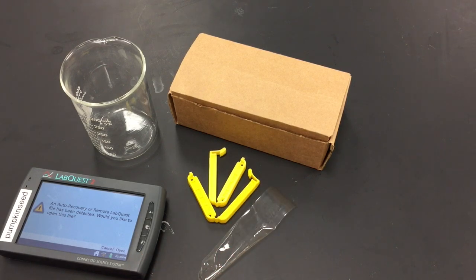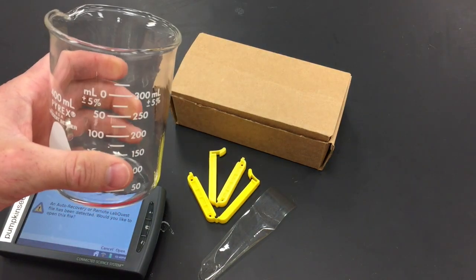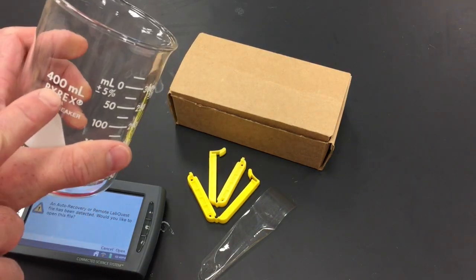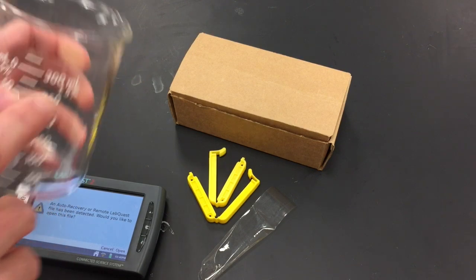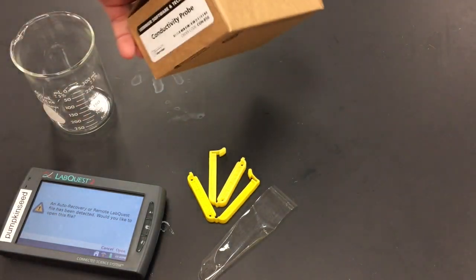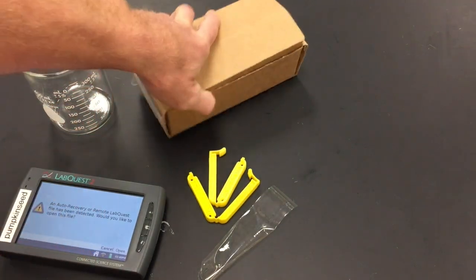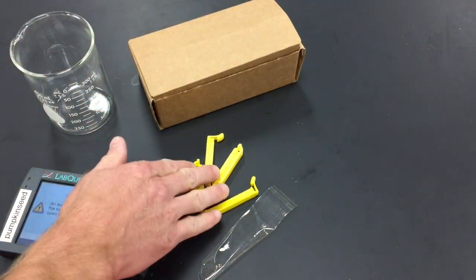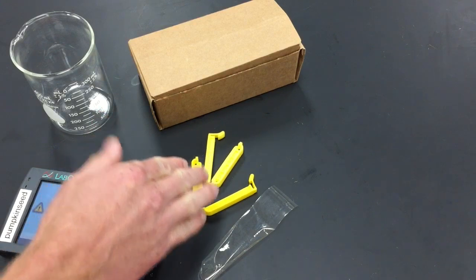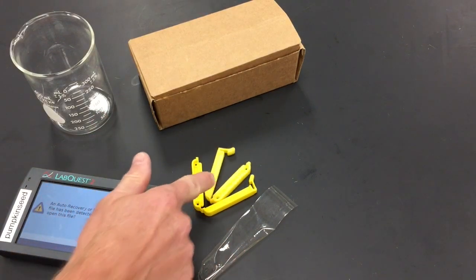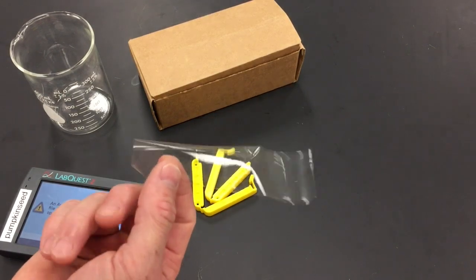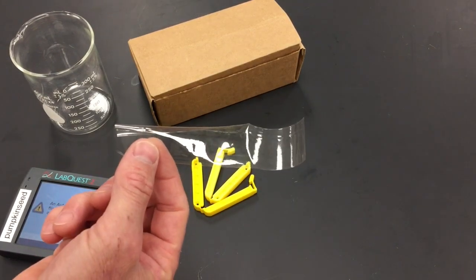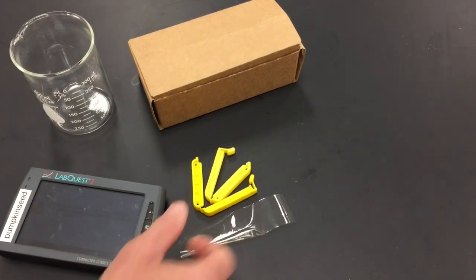The equipment you'll need is a 400 milliliter beaker filled with 300 milliliters of purified water, a conductivity probe, a couple of clamps for the dialysis tubing or string to tie up the ends, a Lab Quest, and a length of dialysis tubing. I cut this five inches or 12 centimeters.